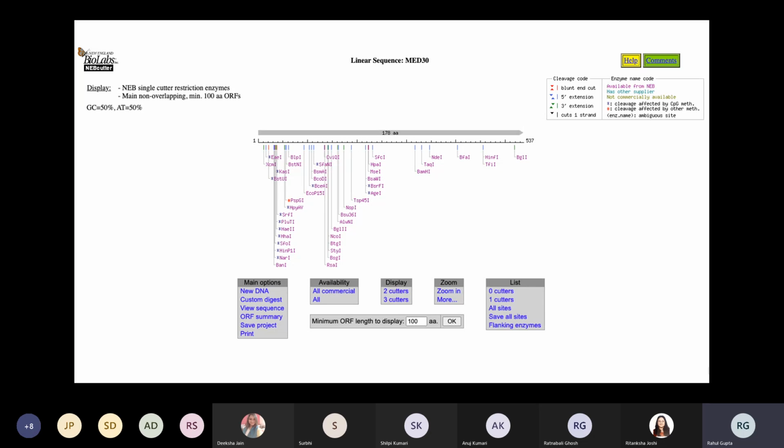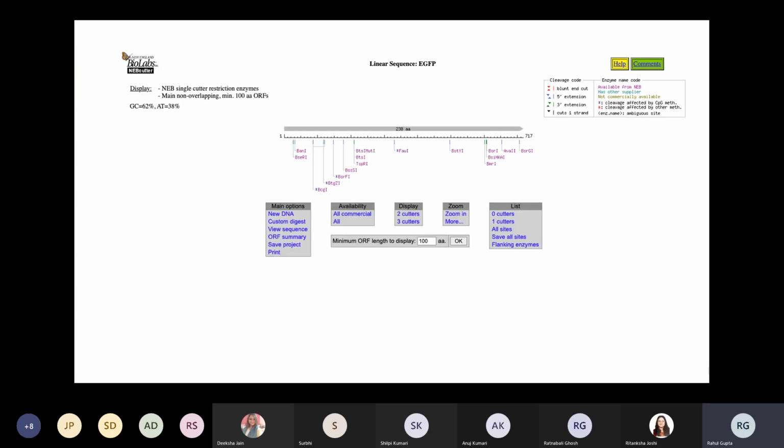And so that is why we have to make a smart choice in choosing the restriction site. The same holds true for eGFP as well. We have to avoid any restriction sites which would be present in the intervening regions of this eGFP DNA sequence, and hence we'll have to choose the restriction sites very wisely there in the vector backbone, because we don't want the eGFP molecule to get chopped off in the middle while cloning it. So that is why a careful choice has to be made.